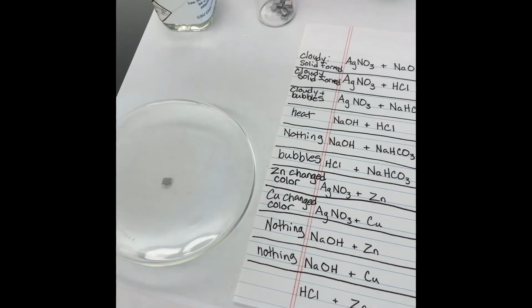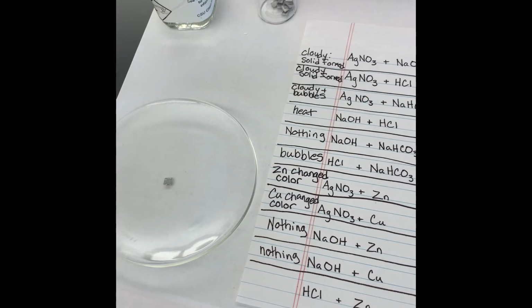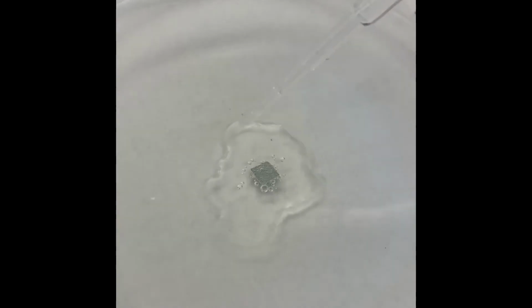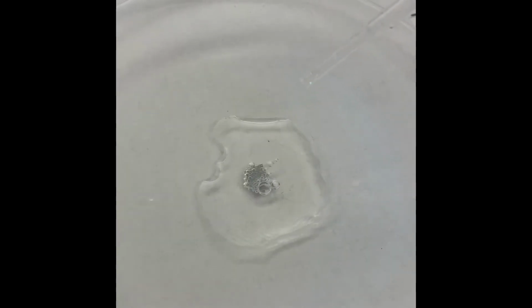Now we have our hydrochloric acid, HCl, and zinc foil. Something's happening.